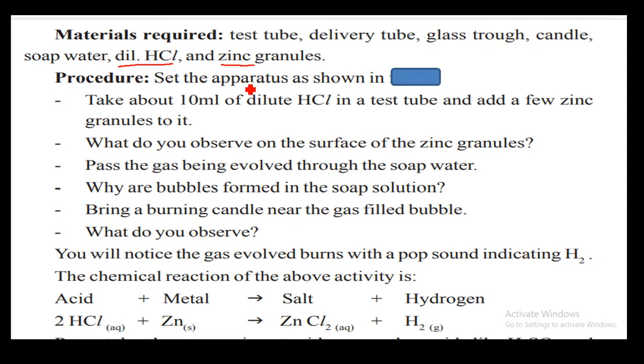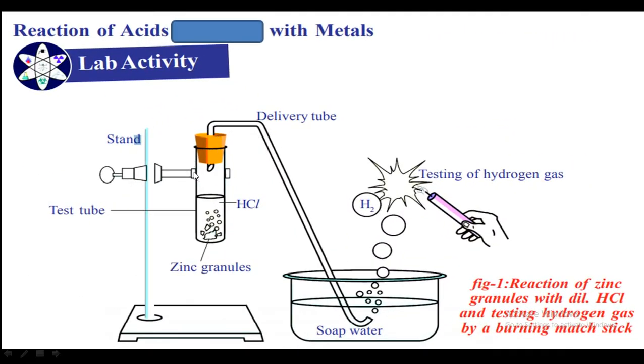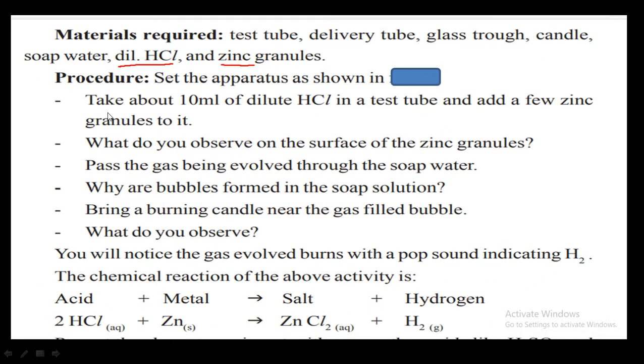Set up the apparatus as shown. Now, first take 10 ml of dilute HCL in a test tube and add a few zinc granules. We observe that a gas is produced in the test tube. Pass the gas being evolved through the soap water.